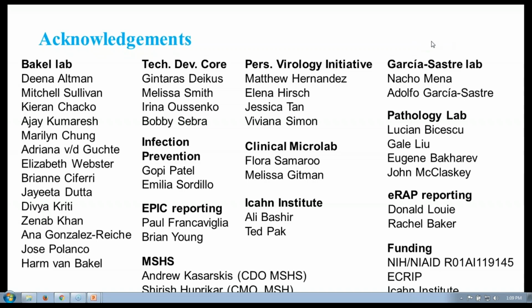No. So the accessory genome is essentially the part of the genome that is more mobile, right? So usually when you do whole genome sequencing, if you do it on Illumina, you'll get read coverage across the entire genome, but you can't typically close it very well unless you include mate pair libraries. And the reason why you can't close it is because there are repetitive elements, mobile elements that are copied multiple times in the genome, and it's very hard to scaffold through those regions.